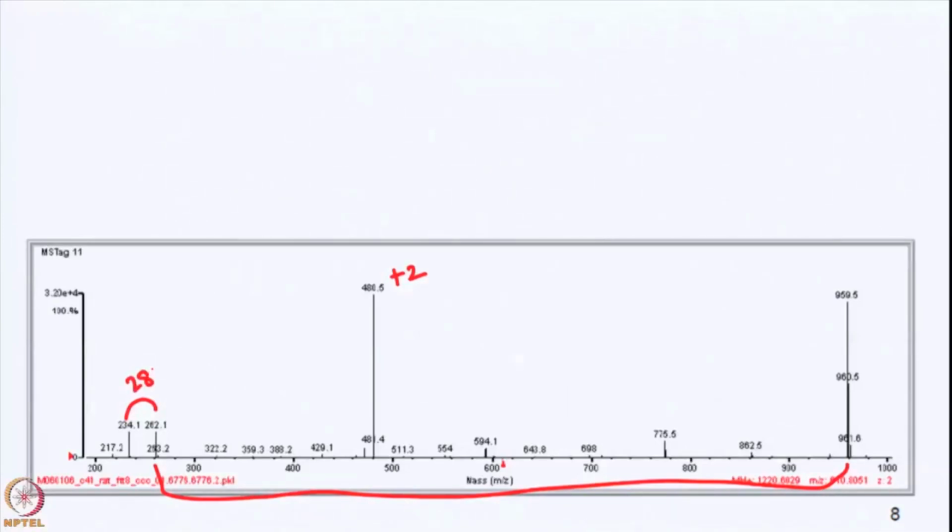What's the ion type of the peak at 262? Okay, this was one of the things that I gave you of useful information. The difference between a B ion and an A ion is 28. So we could assign that as A and that as a B ion. If this one's a B, then that has to be Y.